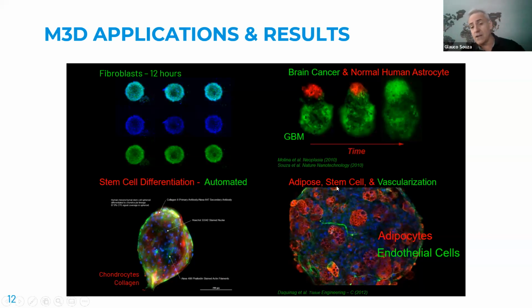On the bottom right here was a co-culture of pre-adipocyte stem cells with endothelial cells. When we first started this work with a collaborator in Houston, we wanted to generate this adiposphere, which looked like in vivo fat but also had the endothelial cell phenotype within the culture. So we co-cultured the pre-adipocyte stem cells with the endothelial cells. The endothelial cells are the green GFP-labeled cells. The red is perilipin, an adipocyte marker. And you can see the sprouting of the endothelial cells within the culture.